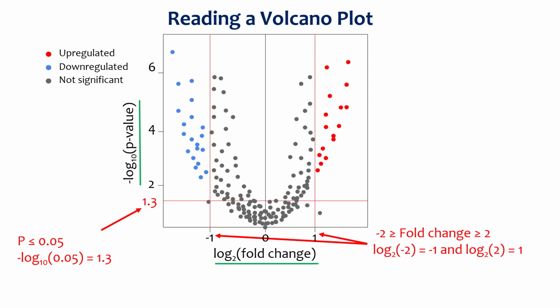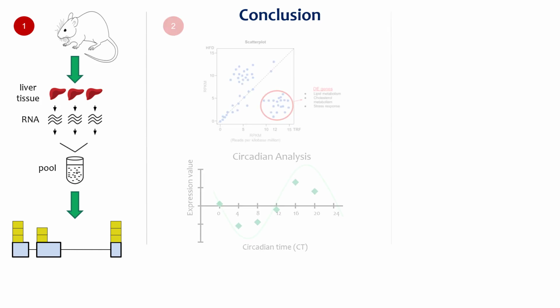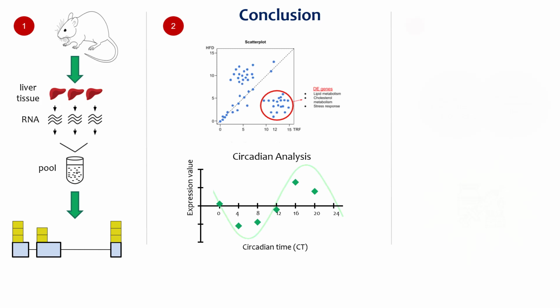Together, the tools and methods we have discussed in this tutorial series allow scientists to understand changes that occur in an omics sample because of a genetic or environmental perturbation and bridge the gap between these changes and an observed phenotype. By sampling every protein-coding RNA expressed in the liver in a time series over greater than a 24-hour period, it is possible to discover the sets of genes that change their steady state or circadian expression patterns in response to clock gene mutations and/or time-restricted feeding.